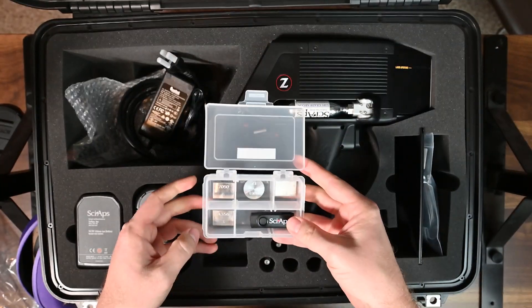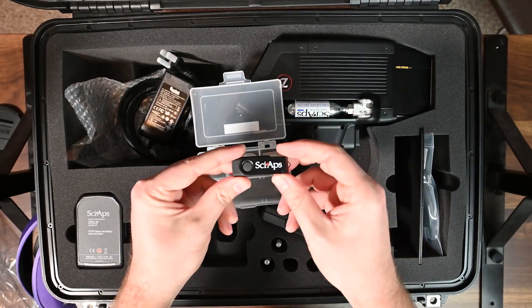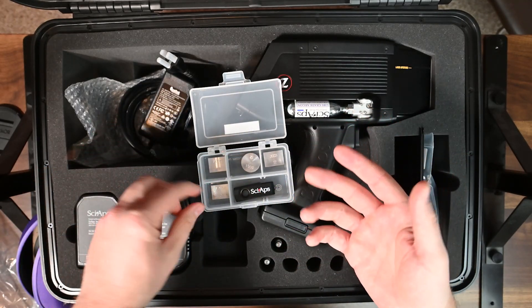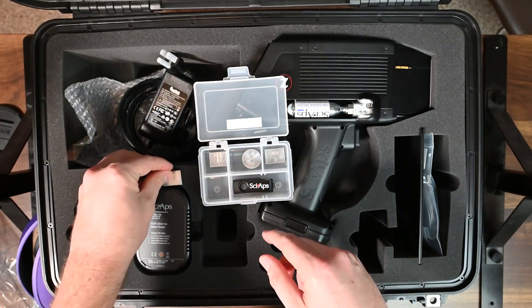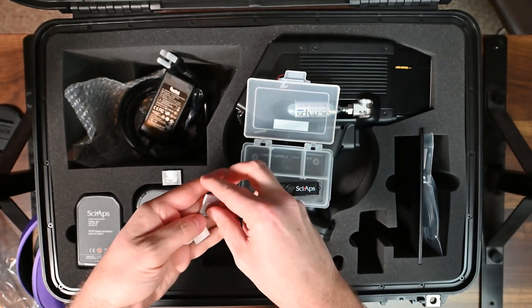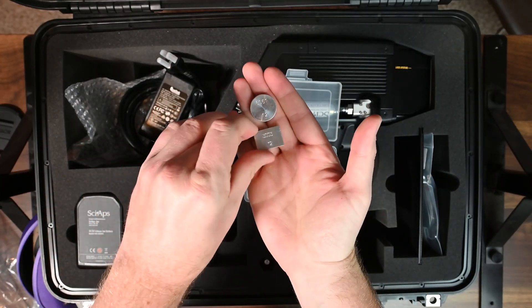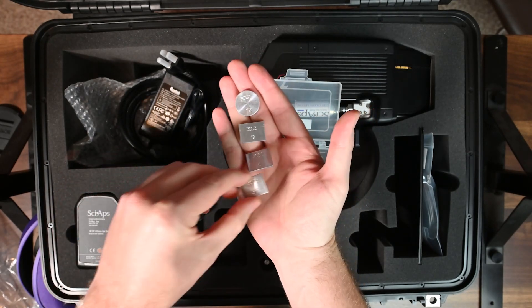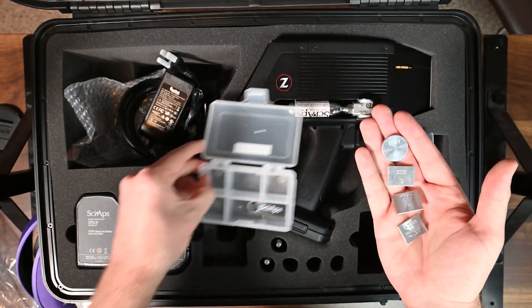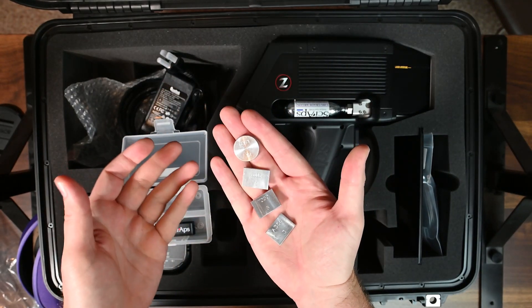We also have a little box — looks like a tackle box — with a bunch of metal samples inside and a USB drive. The USB drive contains your manual and other information about your analyzer. You can run your analyzer without it, but profile builder and other tools are on there. These metal samples are specifically for something called intensity calibration.